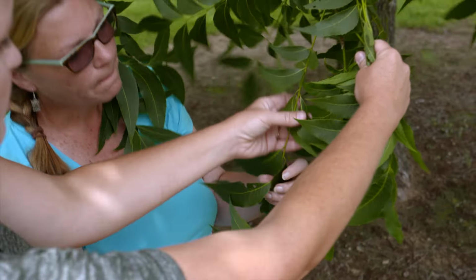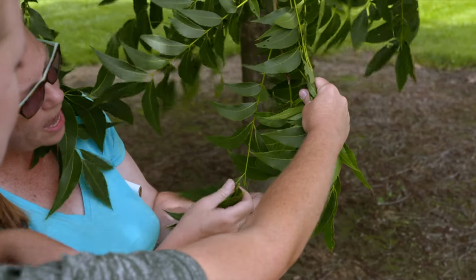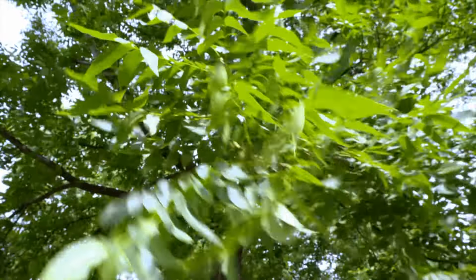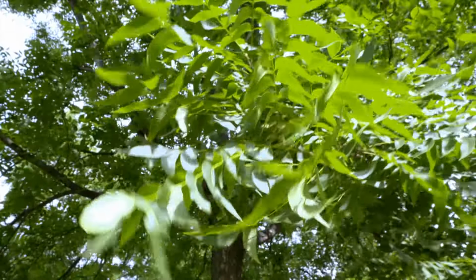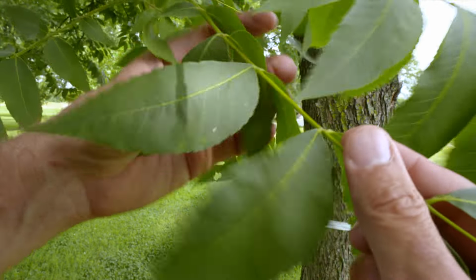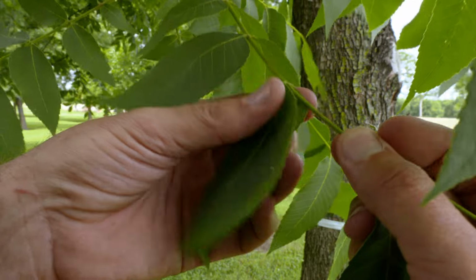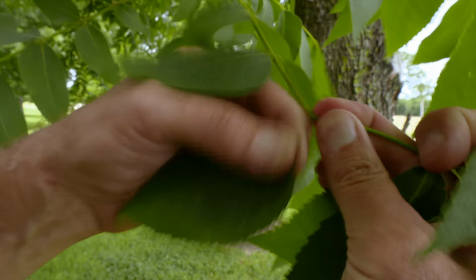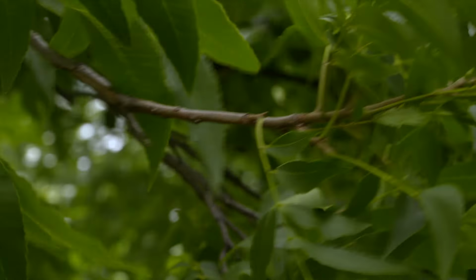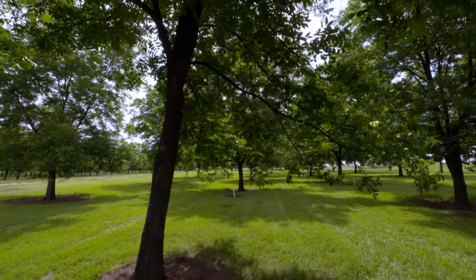Now this one's been chewed on. Would you want to take this one or leave that? Ideally, you want to get leaflets that aren't damaged by any type of disease, insect feeding, or mechanical injury. You'd want to have a whole leaf. And if you do have a tree that has some suspicious leaves, you can sample it separately to see if you've got a deficiency problem in that also.